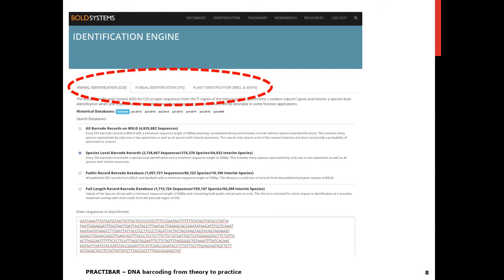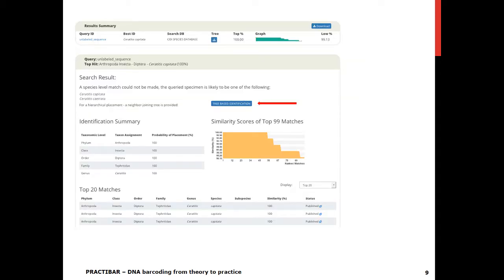So what does happen when you click submit? There is a page that will open with results showing the matched name in the database and the percent of similarity. In this case, the sequence belongs to Ceratitis capitata, or so it seems. Although the first line gives Ceratitis capitata as the best ID with 100% similarity, and although I see many matches for Ceratitis capitata with 100% similarity, the system also tells me that there is a second species, Ceratitis caetrata, so close according to genetic distances that my sequence could belong to either of these two species. I chose this example because it was a pest species, but also to show that sometimes it's not enough to look at the first line and make an informed decision, especially in a regulatory context in which all of you work.